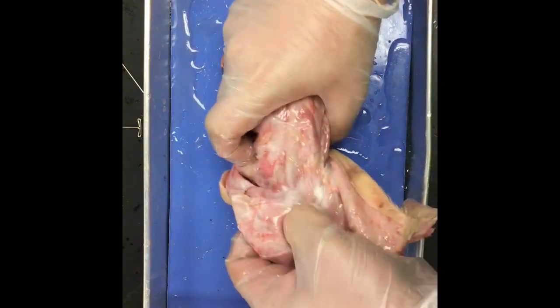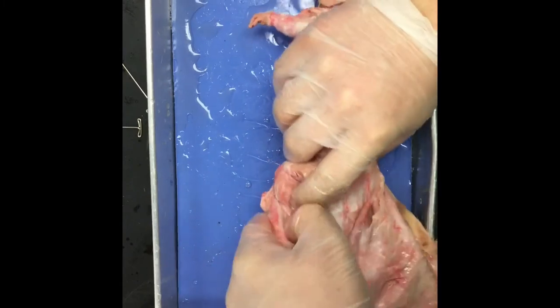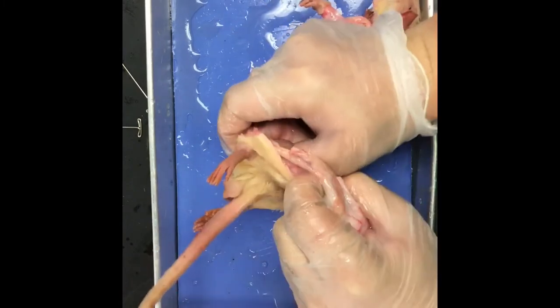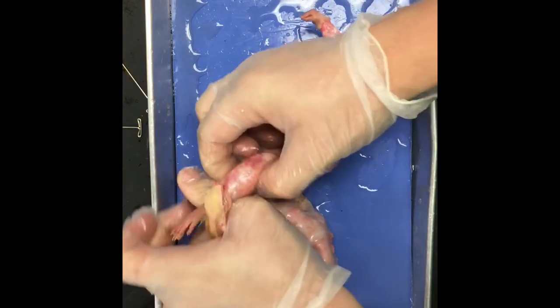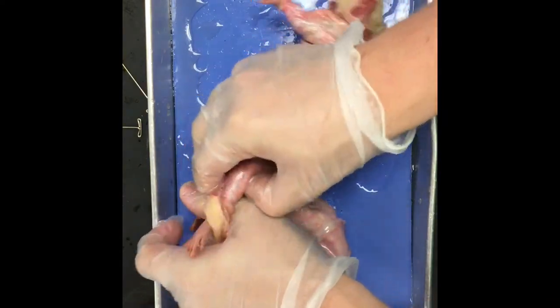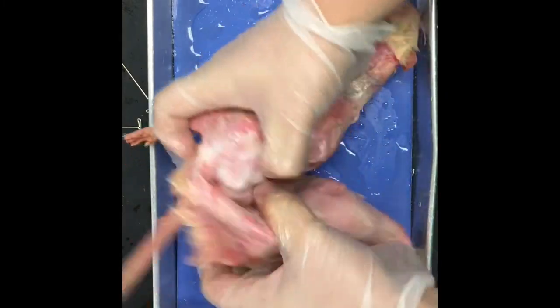All right, so that last part again, through here, coming through. It's a little harder to deglove the legs, but again, you put a thumb through. Boop. Oh, a little juicy. All right.